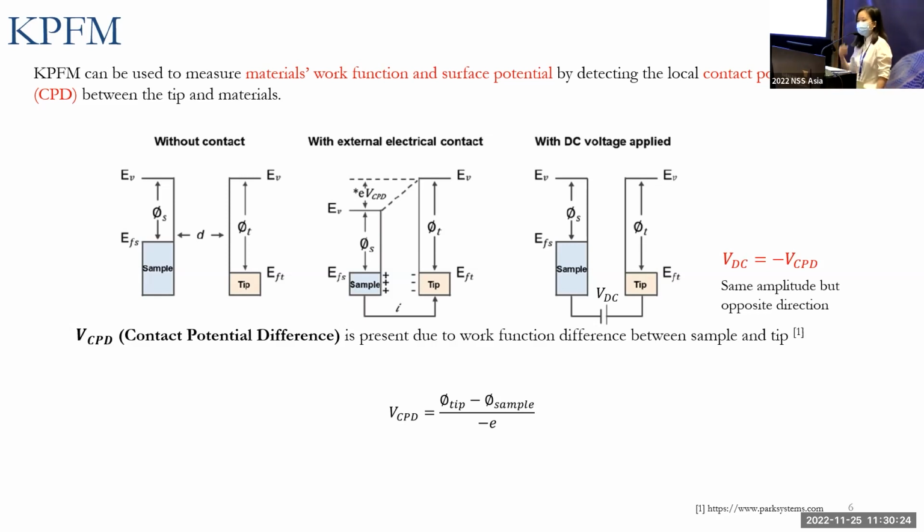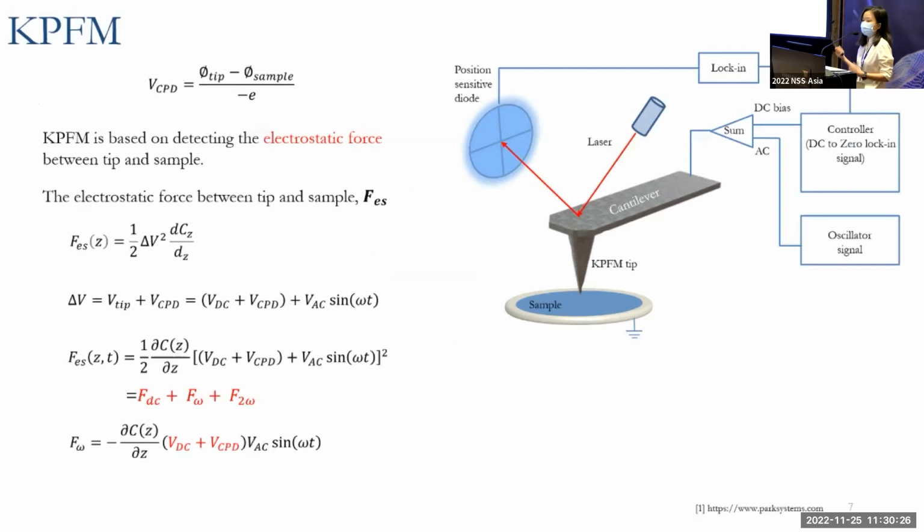Okay, now let's have a look at the KPFM system to see how it works to measure this CPD. Essentially, KPFM is one of SPM techniques, which is based on detecting the electrostatic force between the tip and sample.